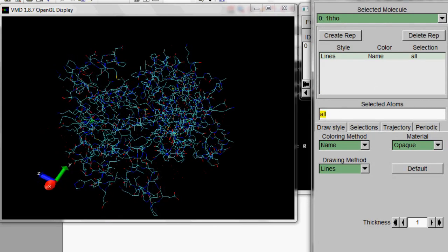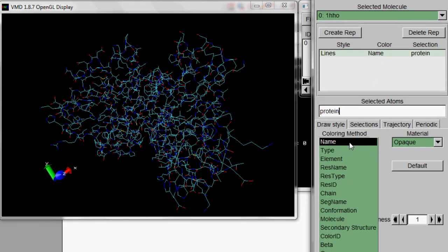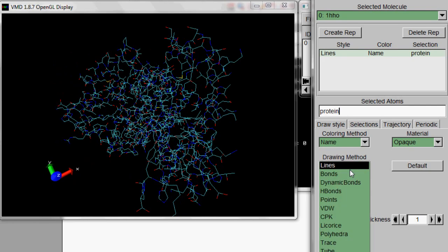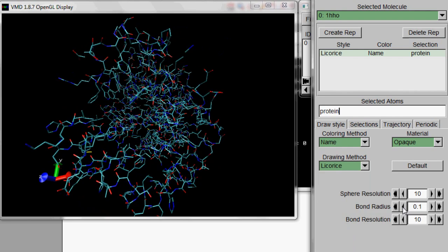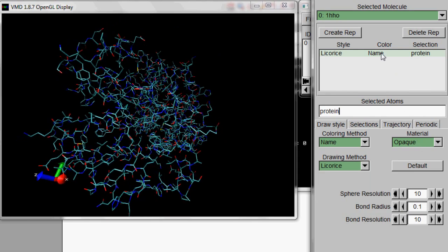Delete the All and type in Protein, then hit Return. There you go. That's just the amino acids of the hemoglobin protein. Now let's find that magical heme group that gives it the excellent ability to carry oxygen.